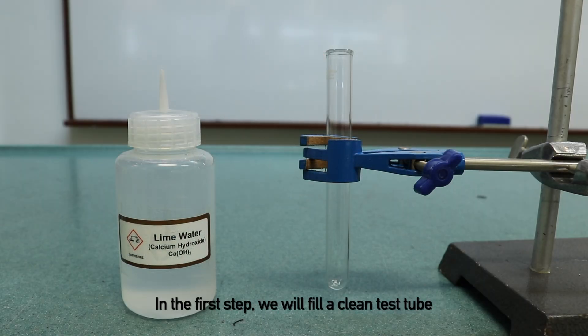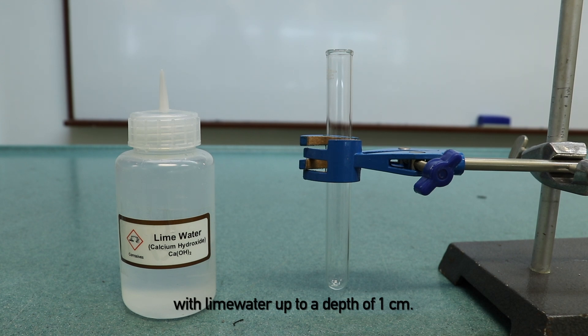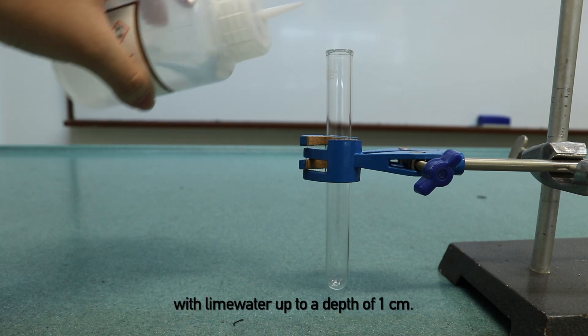In the first step, we will fill a clean test tube with lime water up to a depth of 1 cm.